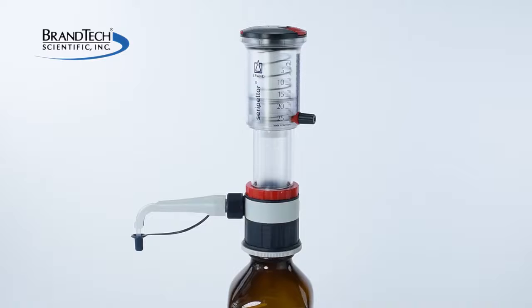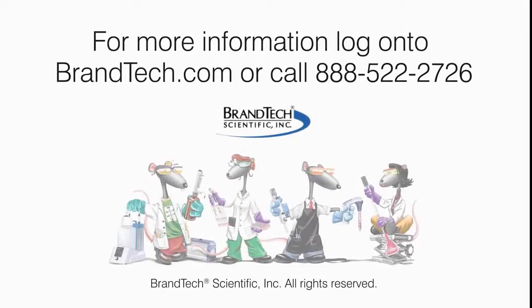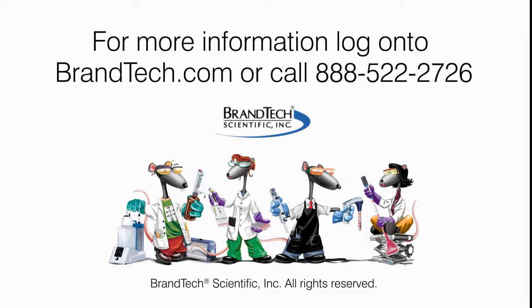The instrument is now ready to be primed for use. If you still have questions and are located in the U.S. or Canada, contact Brandtech Scientific Customer Service Group. And for those from other regions, contact your local Brand representative.